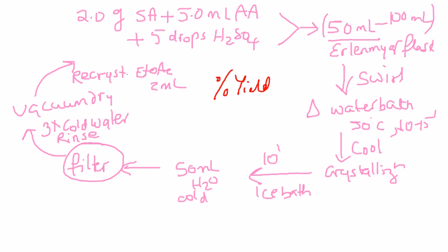So percent yield, we're doing percent yield. We are doing melting point of salicylic acid and aspirin, and we are doing IR analysis of salicylic acid and aspirin. That's what we are going to do. Okay? All right, see you in class.